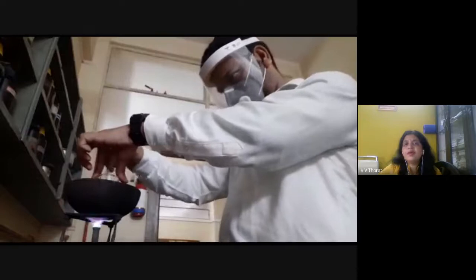Wait. Yes. So we have added HCl and now we are heating it on a sand bath. See, Ravi heated it for 5-10 minutes. See, still yellow is there. Please don't stop. You can see yellow HCl is still remaining in the beaker. When you heat, don't continue heating too long, it will become charred. You remove and scratch the beaker. See, sir is trying to scratch everything. Still yellow is there. So slight heating is required.